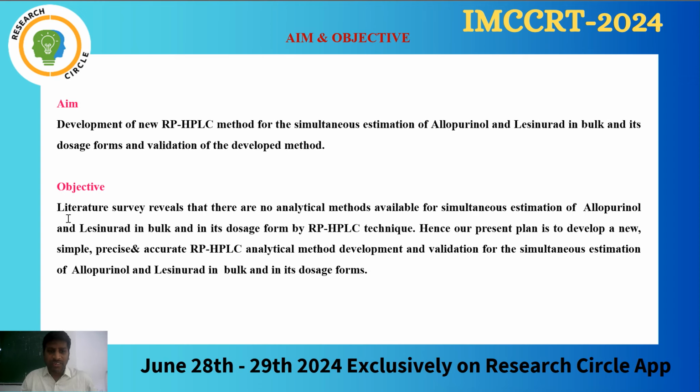Objective: the literature survey reveals that there are no analytical methods available for simultaneous estimation of allopurinol and lesinurad in bulk and in dosage form by the RP-HPLC technique. Hence, our present plan is to develop a new, simple, precise, accurate HPLC analytical method, with development and validation, for the simultaneous estimation of allopurinol and lesinurad in bulk and in its dosage form.